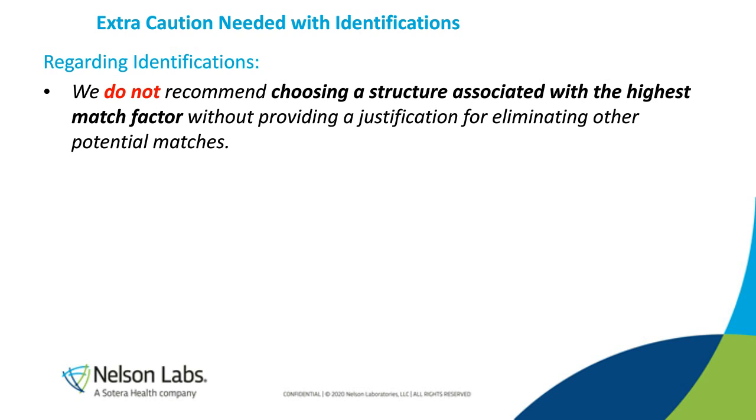One thing better than that, and I think this is what the FDA really expects, is to have an automated ID with both a public and a private database. Usually this private database is supplementing these big public ones in a targeted way. For example, the ones that we try to build contain compounds specific to medical device materials that we know are absent from the NIST. So that private database really adds a lot. And then if you have the peer review there, now the quality of identification is getting a lot better.